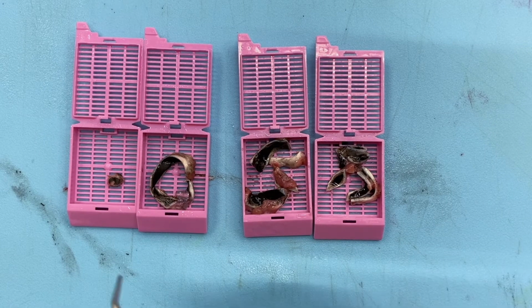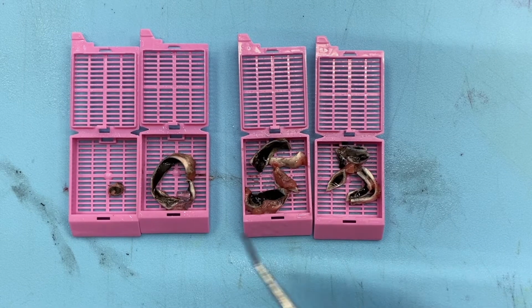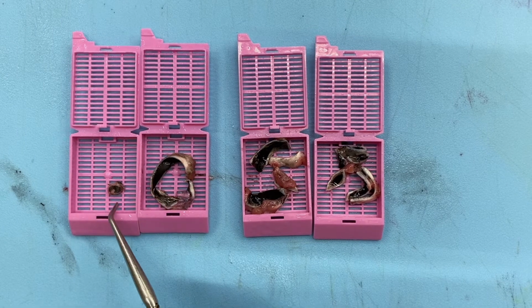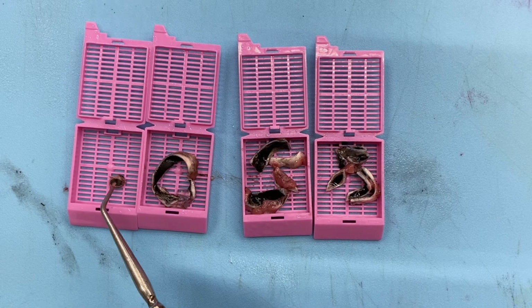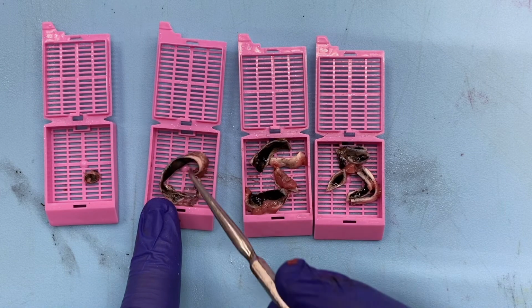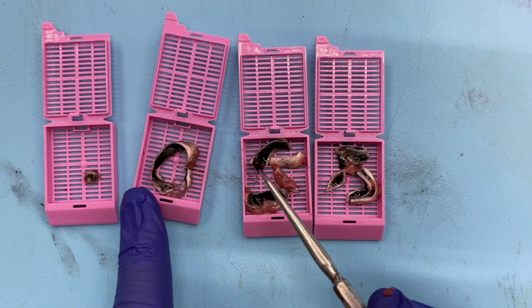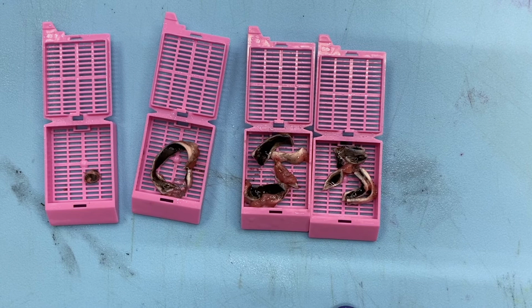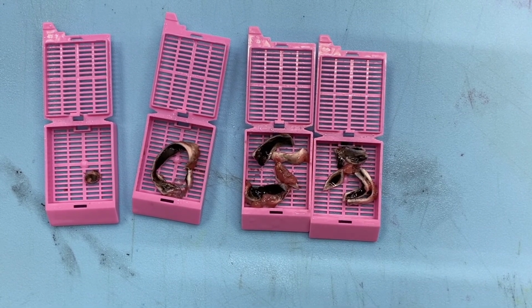And here we go. When all is said and done, we should have about 4 cassettes. Again, assuming this is for tumor, and we were able to fit all of our calottes in a single cassette. But we have our optic nerve margin with an inked surface and shaved, submitted on face. We have our PO section, which we got to make sure has our optic nerve and our pupil in one continuous cut. And then we have our 2 calottes, serially sectioned, submitted entirely. And that's it. So thank you for joining me, and let me know if you have any questions.